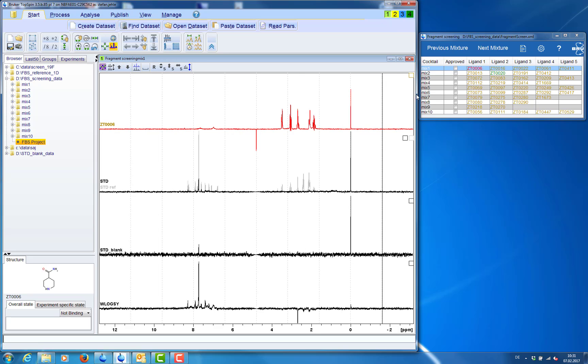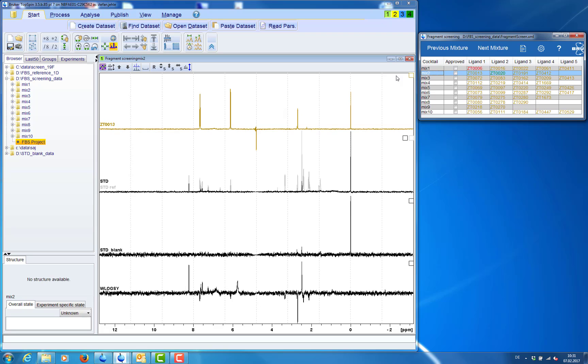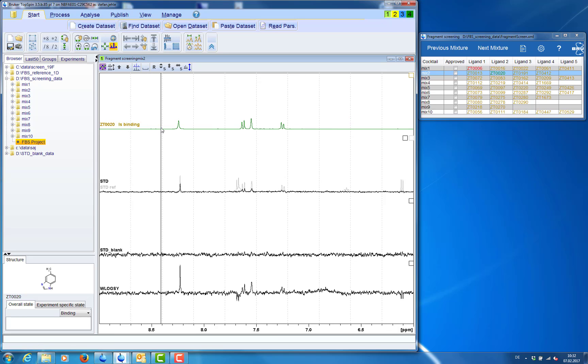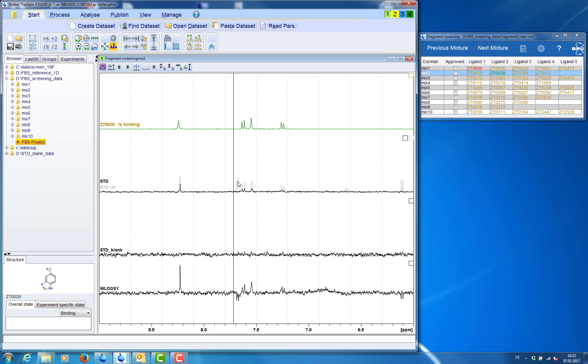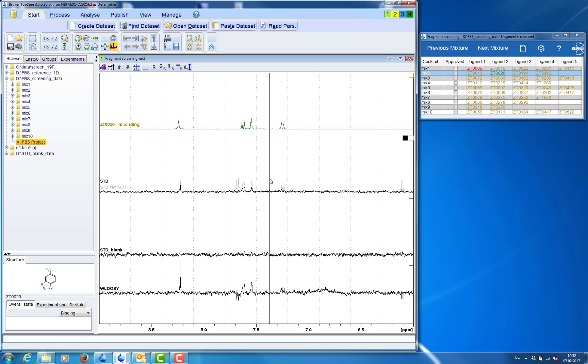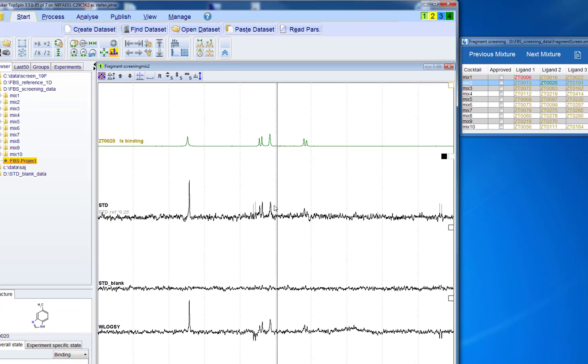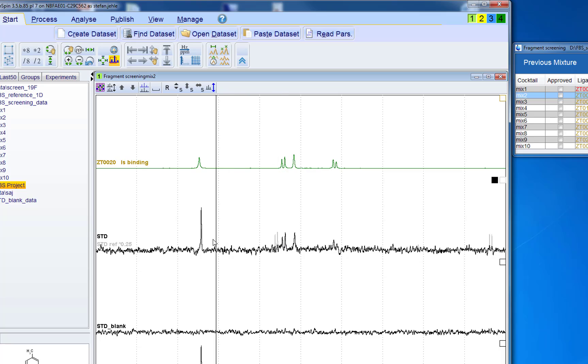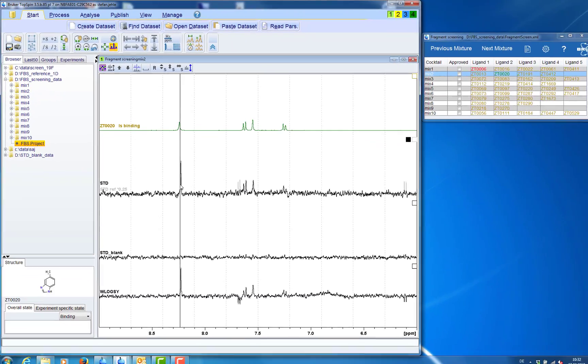But we see one ligand at a time. And we can use the arrows to click through the compound spectra in the mixture. Now we zoom into the aromatic region for the binding ligand. And we can compare it with the std spectrum and check which signals appear in the std spectrum.